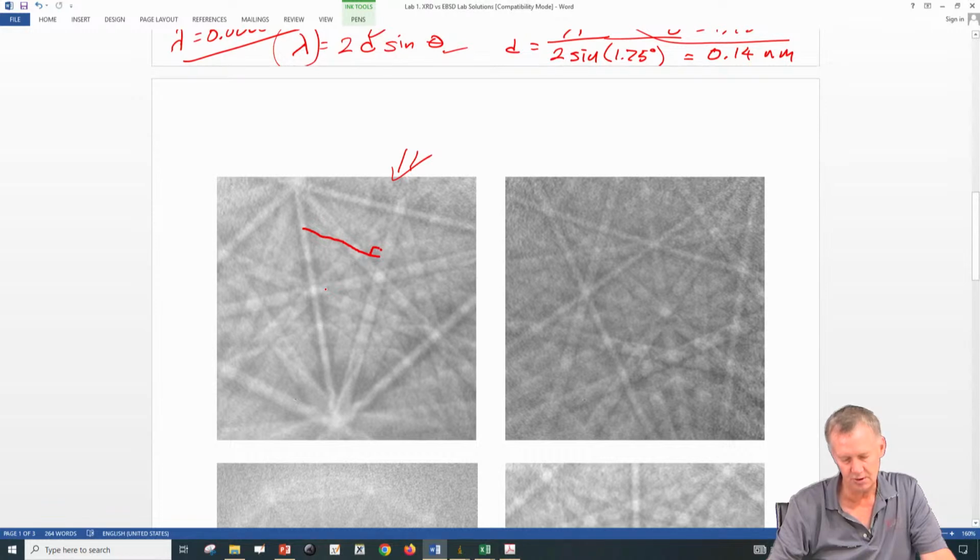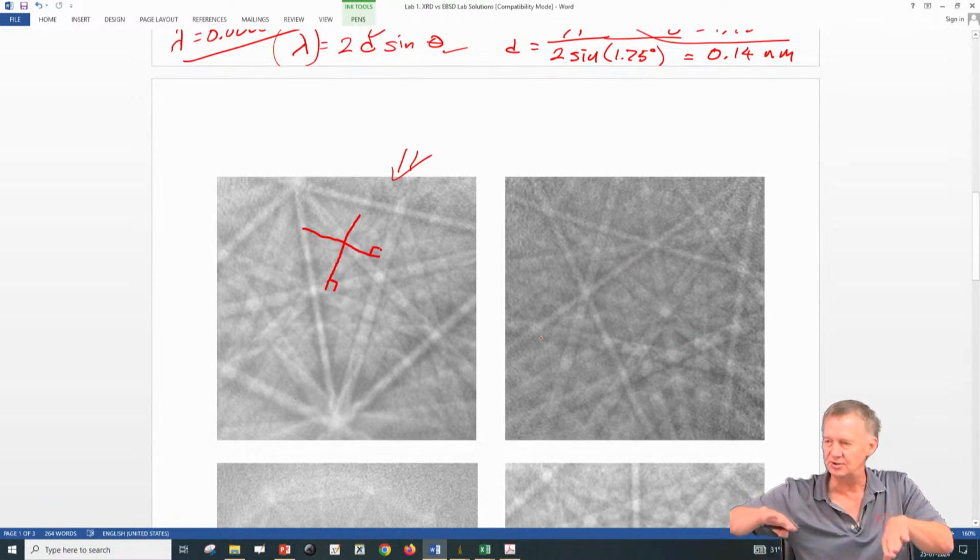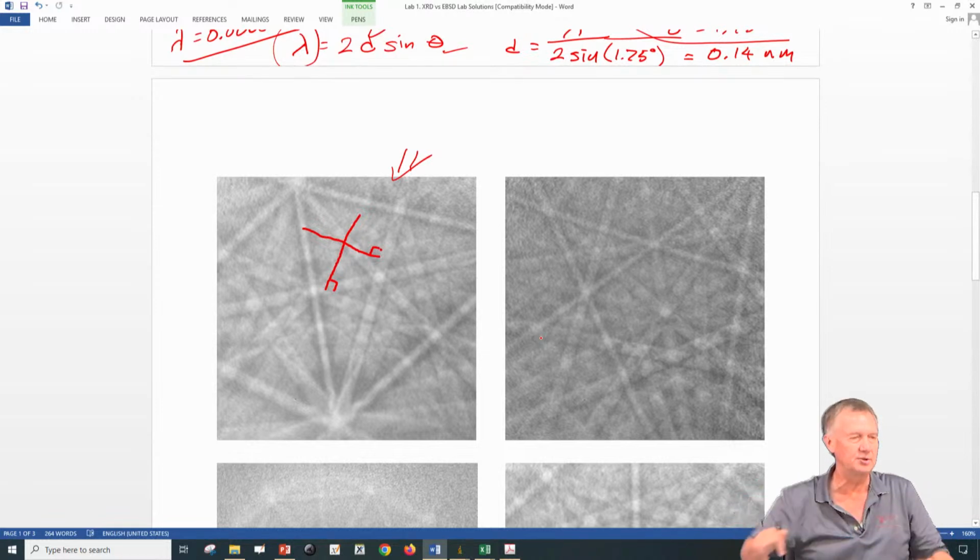Something like that. We draw a normal to this one. We can do the same with any other bands, and wherever they intersect should be where the pattern center is. So just looking at a pattern, if you know nothing about where the pattern center is, you can estimate where it's going to be. We can take any of these and pretty much estimate where the pattern center is if you can see the curvature in the bands and where they get wider and more narrow.